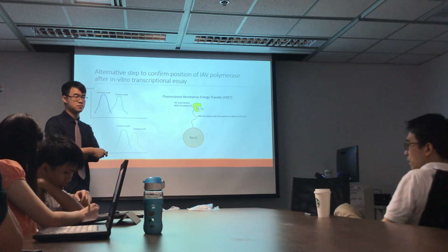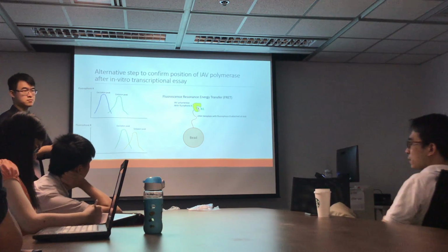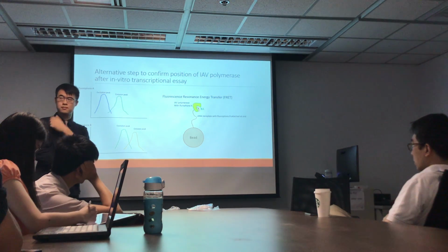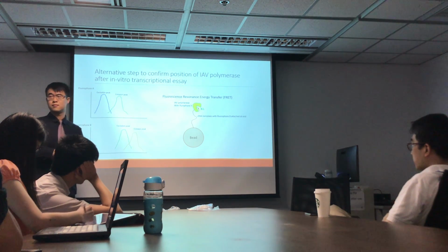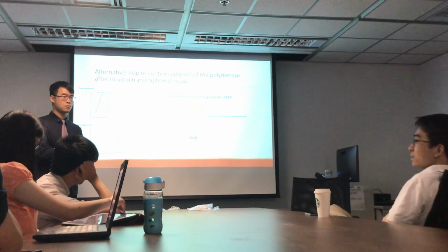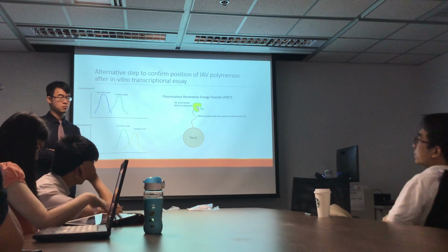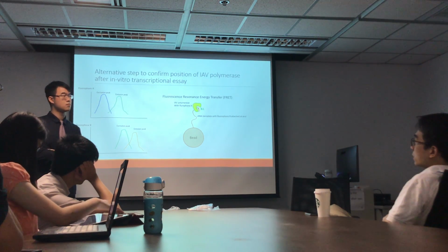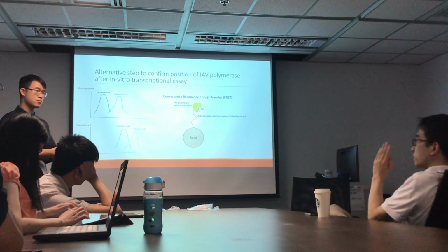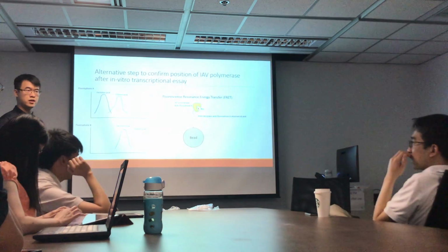So this is how the stop flow people do this experiment. I think they only have a single flow, right? Yeah, theirs are very simple. They're just watching the red fluorophore and the green fluorophore, and how they have the resonance transfer. I think that's different from this. This is flow cytometry, and theirs is stop flow. It's a different experiment. My understanding is you're looking at the scattering, forward scattering, and that's just to confirm the cell depletion.